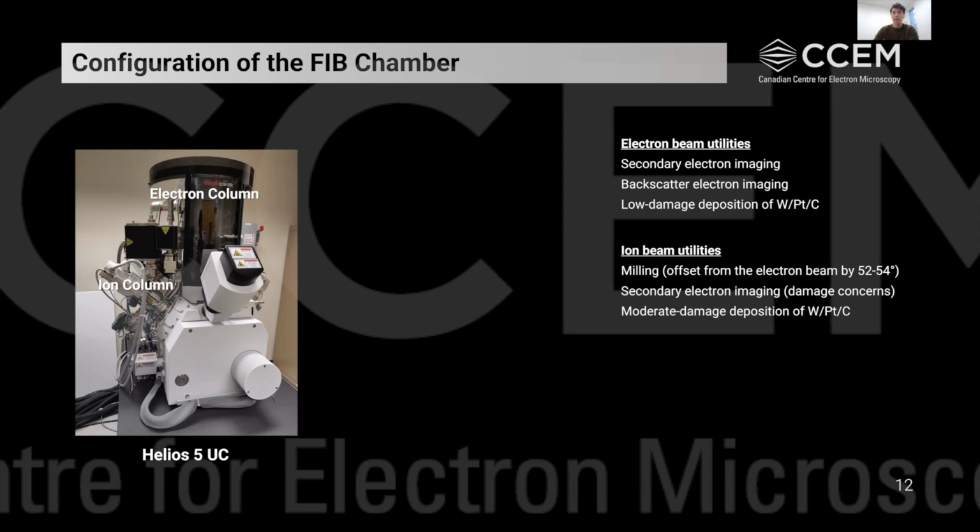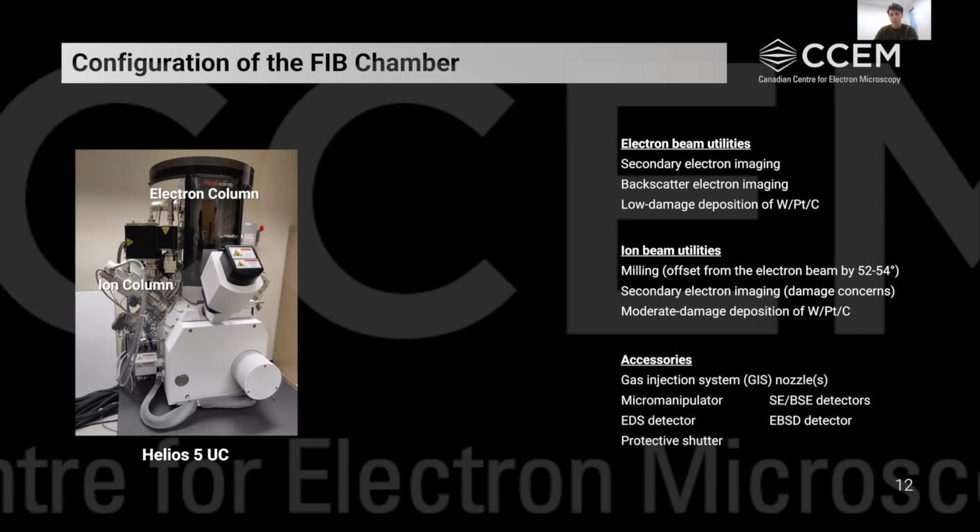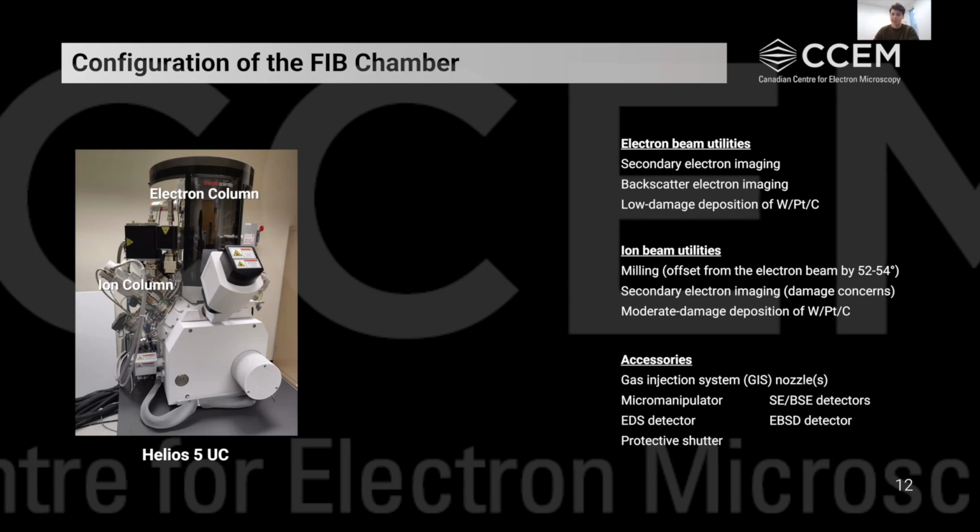So we can generate an electron image using our incident beam of ions. And as well, we can use these ions to do, again, deposition of tungsten, platinum, or carbon on our sample surface. As well, there's a number of accessories that we can couple here on the side of the microscope, things like a micromanipulator, things like specific detectors, and things like the actual gas injection needles themselves.